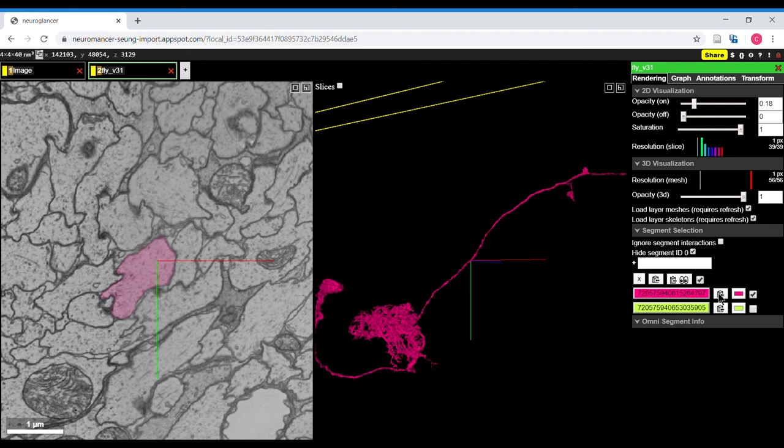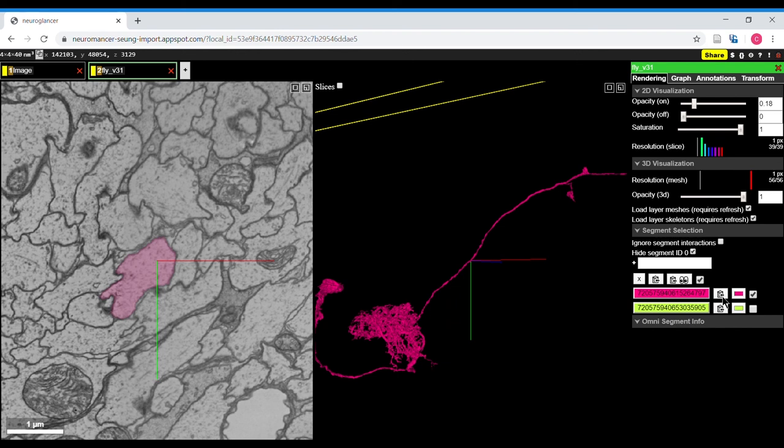There's a bit of a bug in this button that it should turn green and let you know that you've successfully copied this segment ID. If it fails to turn green, then it isn't actually copying it, and there's a little workaround that if you just click once in this box, then this should start to work again.